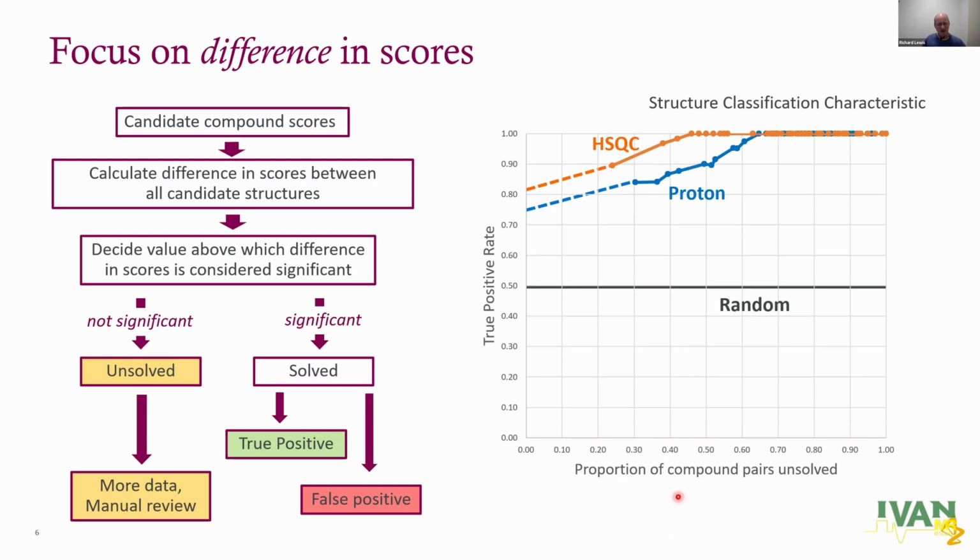How can we get it a little bit better? This is where I'm going to talk about some other data, non-NMR data. Just for information, we could run a carbon spectrum, and that does get a little bit better, but not masses better than the HSQC, actually. So the HSQC seems to be quite a good sweet spot as a spectrum type to use.